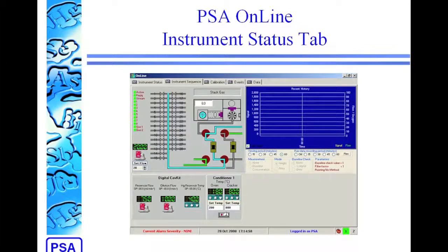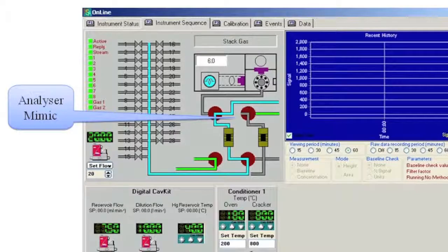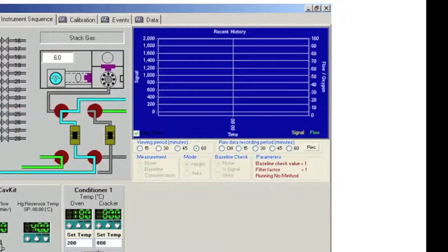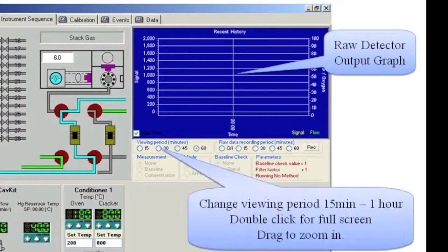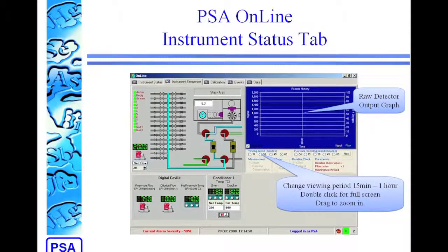The instrument status tab shows more behind-the-scenes information about what your analyzer is doing. First of all, there's the analyzer mimic, which is a little graphical representation of the analyzer. This is for a Segalahad, and it's showing the gold traps that are present. You can see sample gas or carrier gas come across them, and traps heating and cooling. You also have the raw output of the detector shown on a graph. You can change the viewing period between 15 minutes and 1 hour, zoom in on the Y axis, and double-click on the graph to bring it up to full screen.